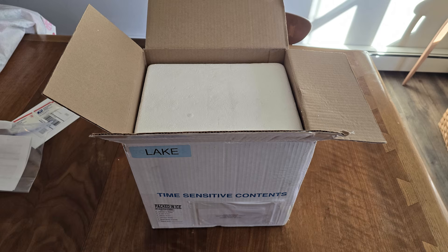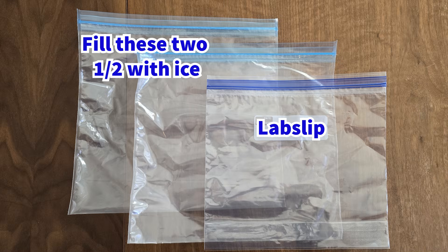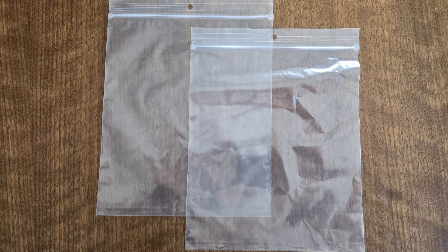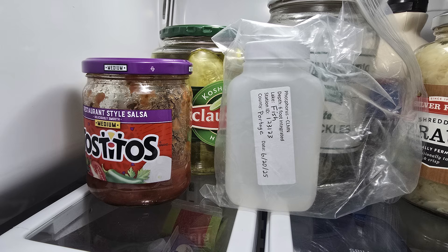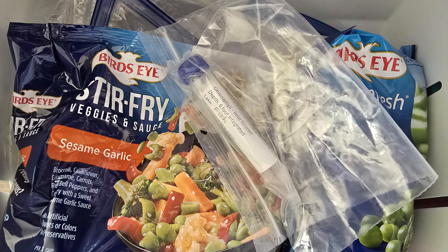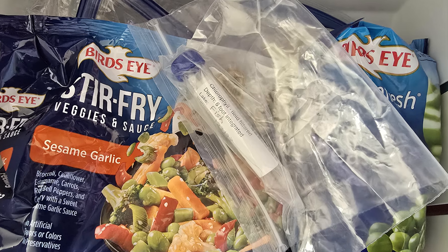Inside your water chemistry shipping cooler you'll find three gallon size plastic bags. One of these is used to hold your lab slip and the other two each need to be filled about halfway with ice cubes. The two sandwich size bags are used to hold your water sample bottle and your chlorophyll tube. Please store your water sample bottle in the refrigerator overnight and your chlorophyll tube in the freezer so that they're as cold as possible when you pack them up for shipping.